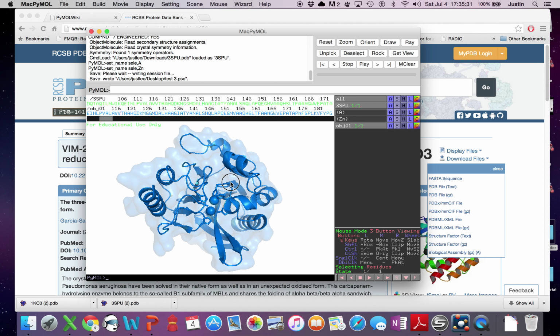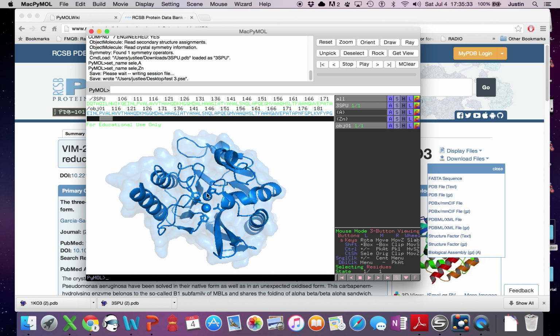Unfortunately, Pymol doesn't allow you to just select the active site anymore. So I'm going to deselect. Oops, no, I don't want to do that. It's going to select the individual amino acids that are involved in the active site. So I'm going to go back to object 1 and recognize all the residues in my active site. I'm going to go to His 120, His 122, aspartic acid 124, and scroll down, all the way to histidine 189. I need cysteine 208 and histidine 250.